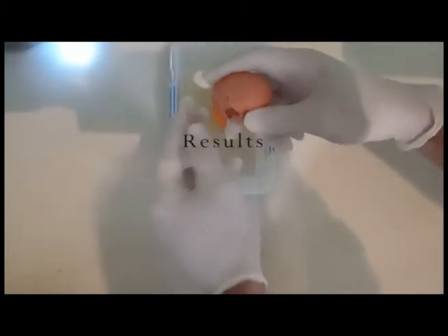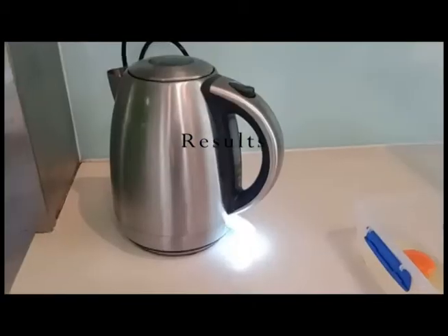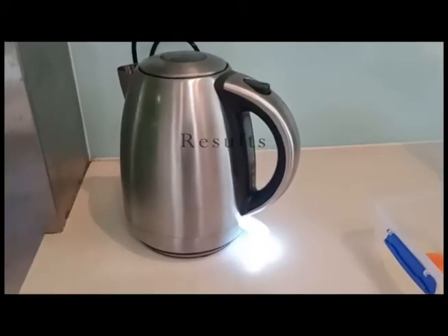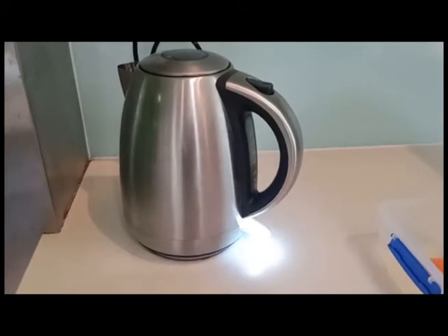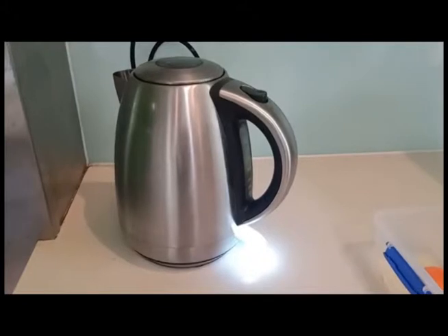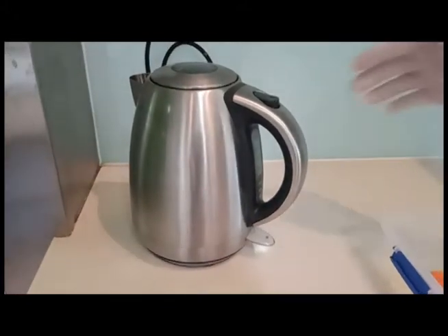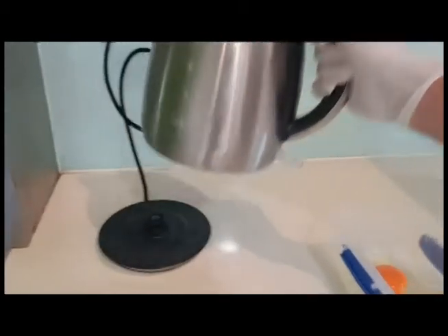The results show that 90% ethanol was best at denaturing the proteins, followed closely by the use of boiling water, and then followed by 40% ethanol, citric acid, and finally 66% citric acid dilution. The control showed that the raw egg remained completely unchanged. The 40% ethanol had a moderate effect of denaturation.